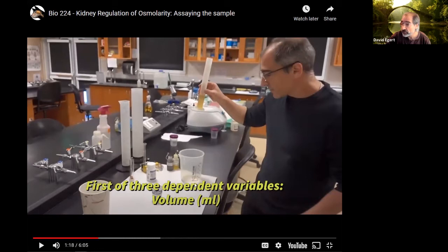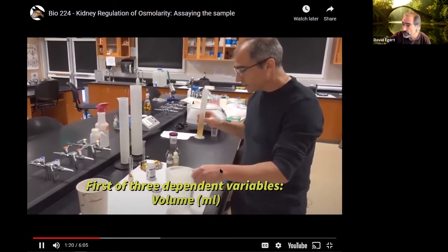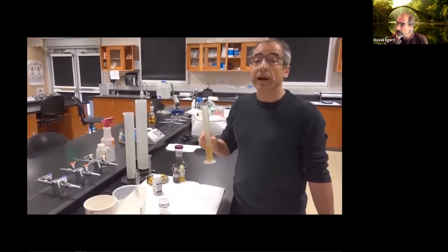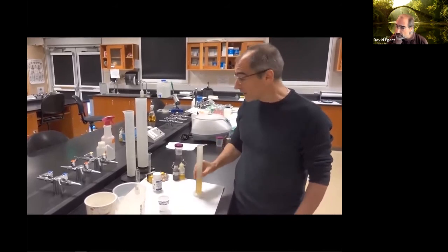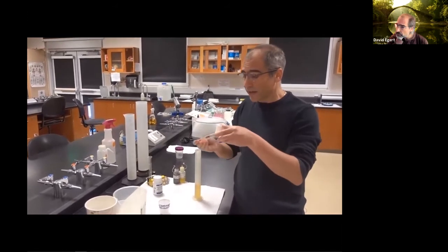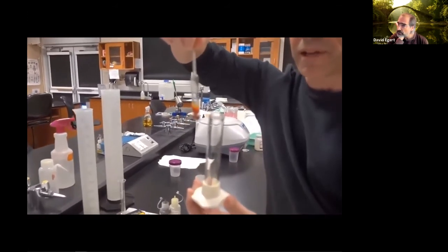For every time, every half hour, each person in each group is going to measure 3 things. One is the volume. That is the first part. I'm also going to want to measure its specific gravity. For that, I'm going to use this urinometer. It's basically a little vial and this float. It's kind of a hydrometer, like if you were making beer.